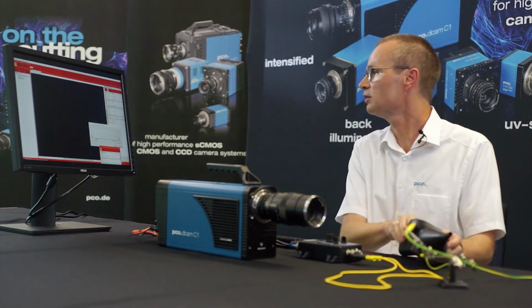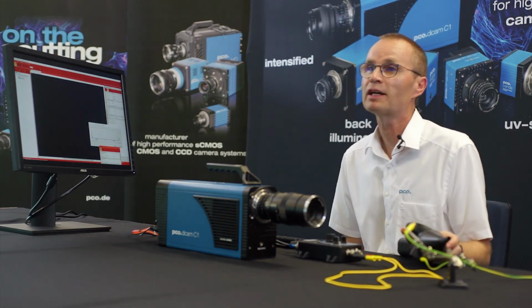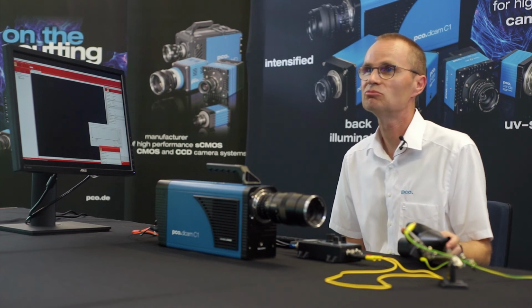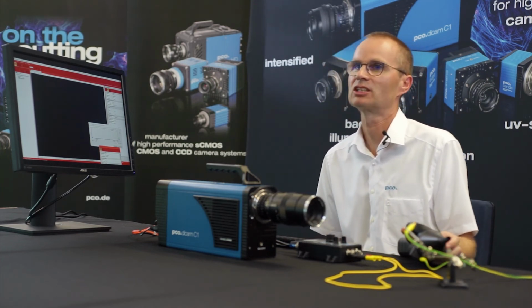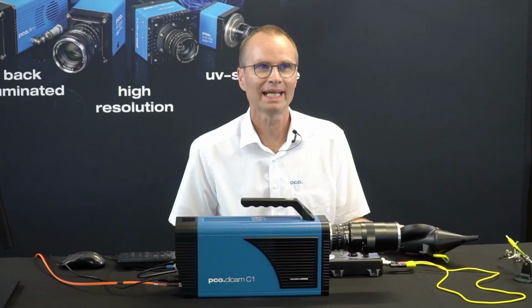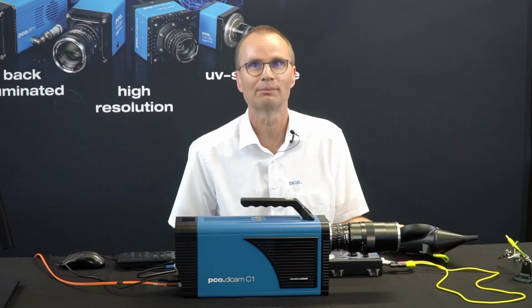My preview window stays dark. 500 nanoseconds later is too late. I completely missed the event. It's actually fast. Okay, enough for a jump start into intensified imaging, and enough for now. More details coming soon.